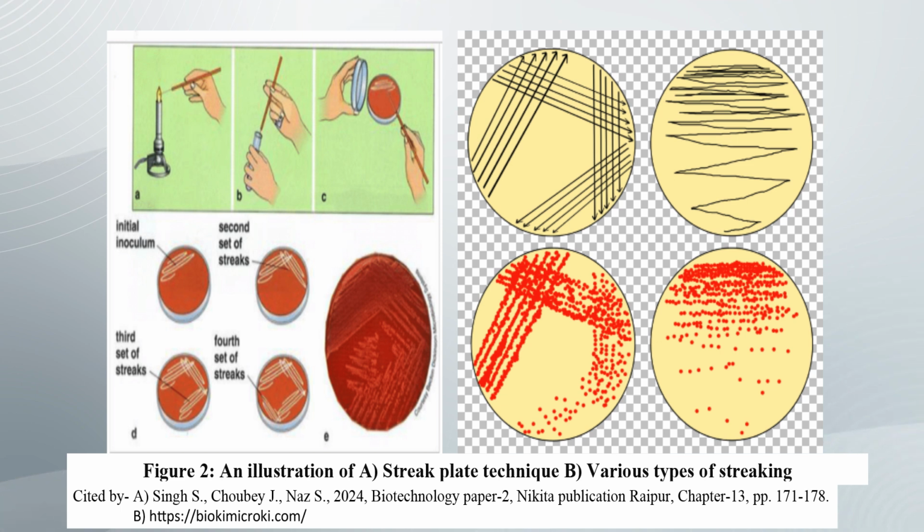Radiant streaking. In this streaking method, the inoculum is spread on one edge of the petri dish. From the edge, vertical lines are streaked in the upward direction. Next, the vertical lines are streaked horizontally to obtain pure isolated cultures. Advantage: this is one of the most popular techniques used to obtain isolated colonies of bacteria. It finds a great application in biotechnology as it can be used to identify transformed bacteria from non-transformed bacteria by adding an antibiotic to the growth medium.